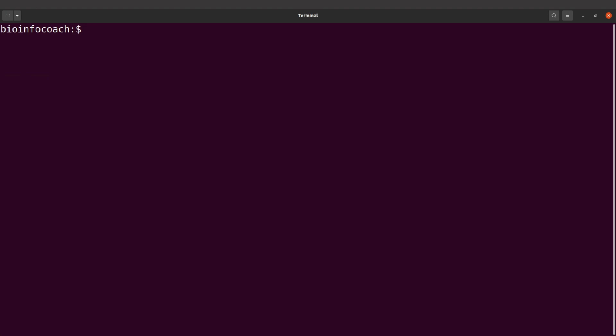Okay, we are back to the terminal. So again, let me say that you need to make sure you have Mamba installed. So check the description box. The link to that tutorial I made on its installation is there. Okay. So what we are going to do is to add another channel. So we add bioconda. So we say conda config add channels, and we are going to add bioconda. Perfect, that has been done.